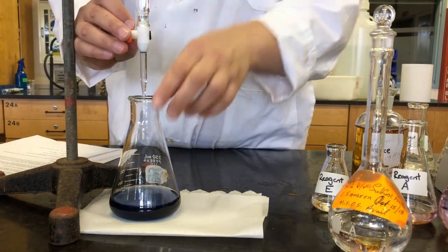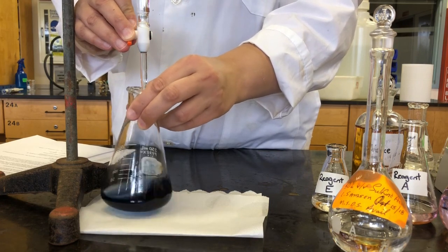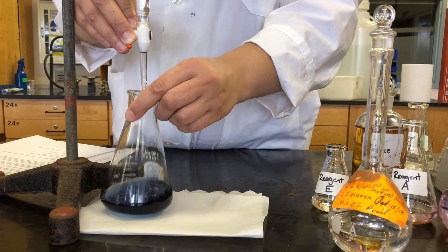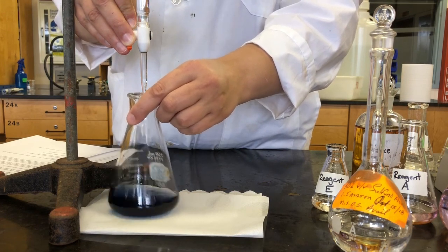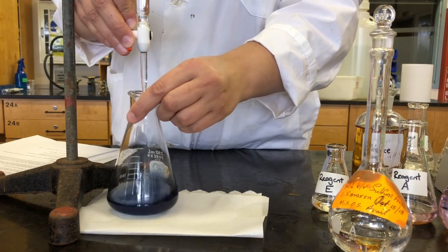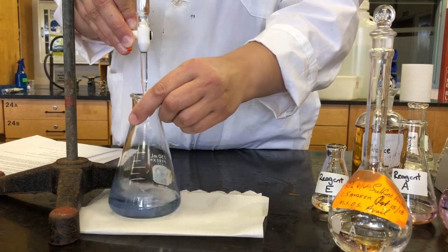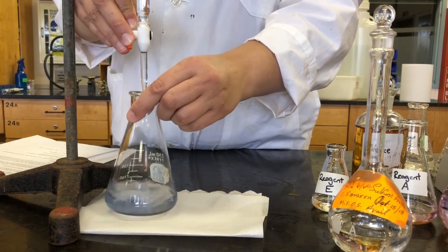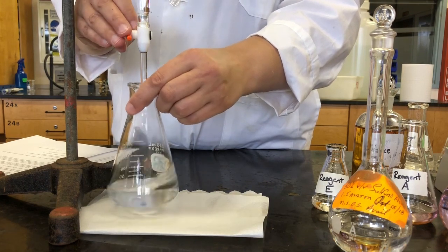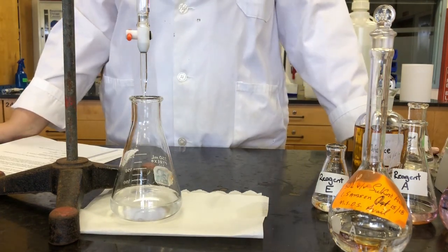So I haven't taken any readings at this point because we're still going. Okay, so we only took our initial burette reading. We're going to continue our titration until we get a colorless endpoint. So a clear colorless endpoint is what we're looking for. So all the blue color is gone. It should not take very much at this point. There we go. Clear, colorless, and that's our endpoint of our solution.